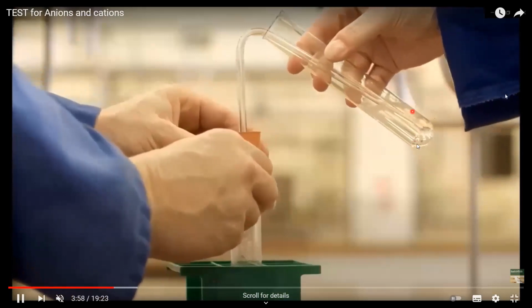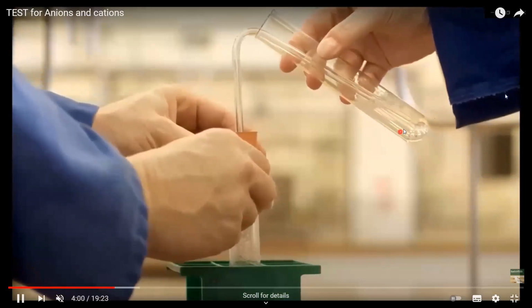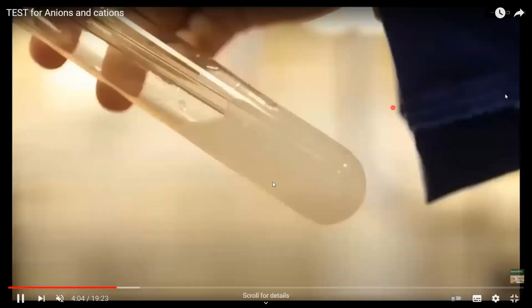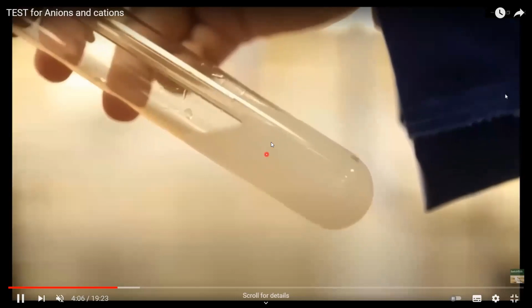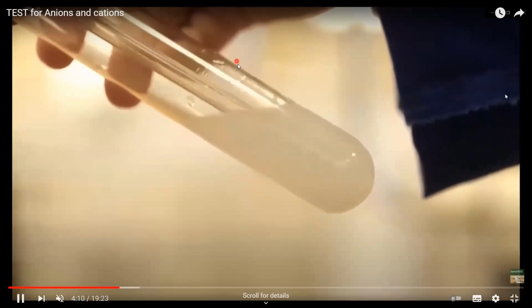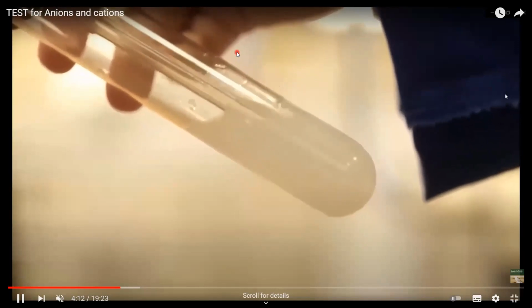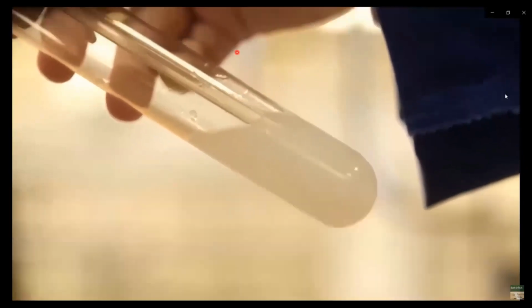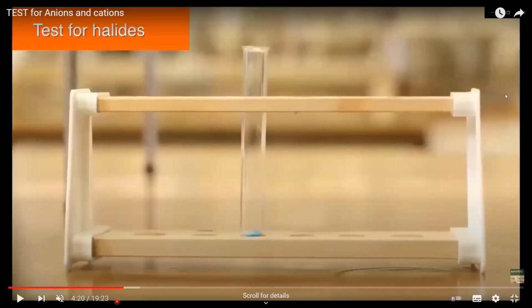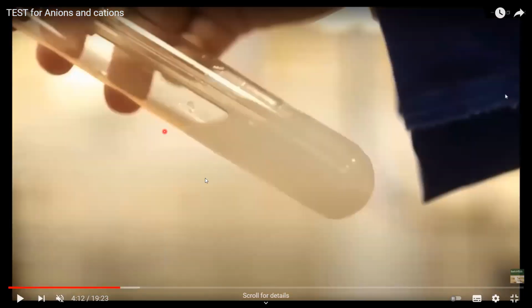This is lime water, which is calcium hydroxide. What happened to the lime water? The lime water turns milky or chalky. The lime water turning milky confirmed the presence of carbon dioxide, and release of carbon dioxide means that there was a carbonate ion. Is it clear? The previous one, the carbonate. Any question or doubt till carbonate?